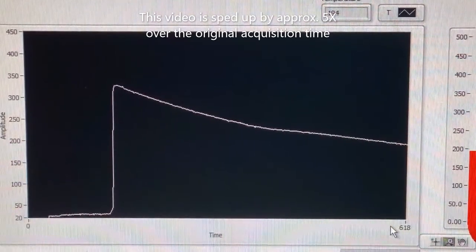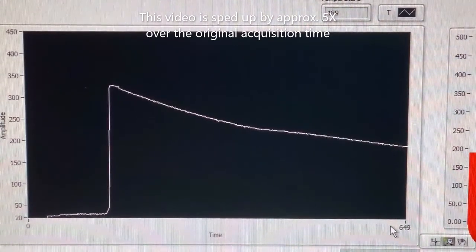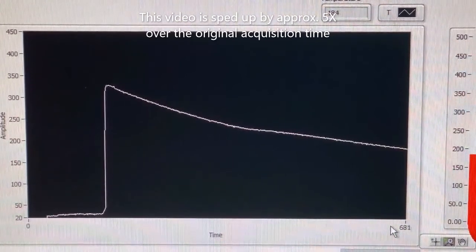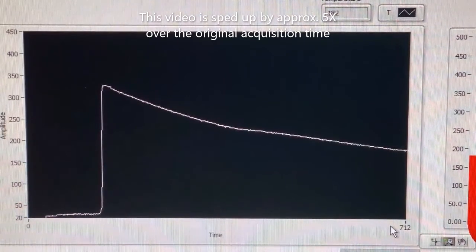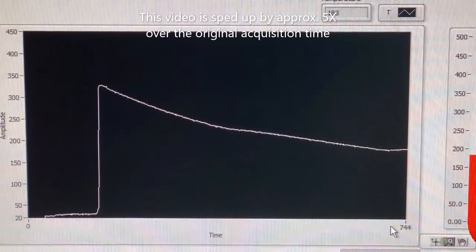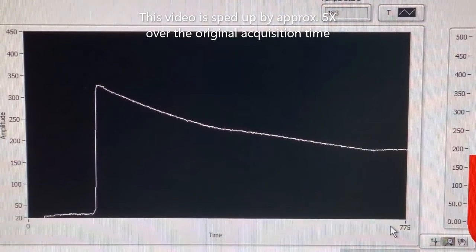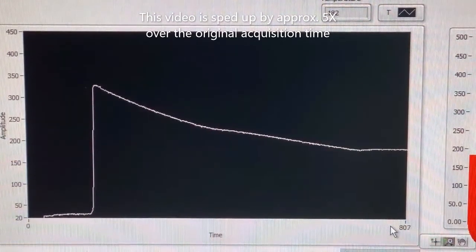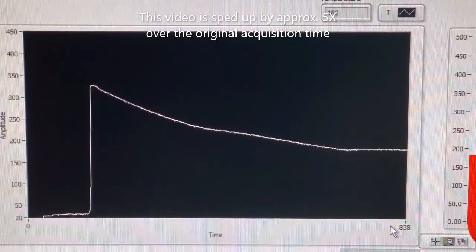Now, as the liquid-solid two-phase region reaches 183 degrees C, which you will recall is the eutectic temperature of the lead-tin system, the sample will now reach an isotherm. This is where the liquid present has shifted its composition all the way to the eutectic composition. Now the remaining eutectic liquid must liberate the heat of fusion to transform into the two solid phase alpha and beta phase constituents below 183 degrees C.